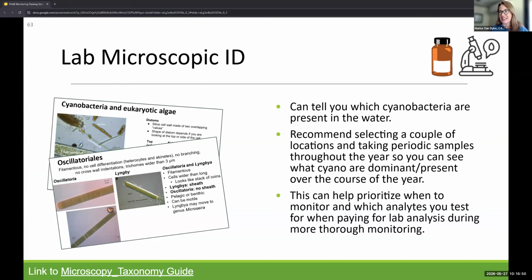Microscopy identification is not easy, particularly to get to the genus level, especially species. So really just family or genus level is necessary for cyanobacteria. What is most useful is knowing: do you have green algae in that sample predominantly, is that dominant, or is it cyanobacteria? If you've got dominant cyanobacteria, you want to take next actions. If you don't have that capacity internally, many laboratories across the country, many in the state, offer microscope identification. And while they're identifying who's there, they also enumerate, or count, how much is there. That helps you get the biomass and density, the cell counts.